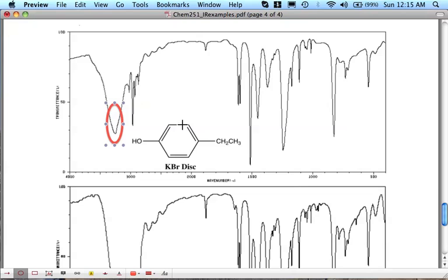It's those C=C vibrations. And remember I said there's usually multiple ones at slightly above, starting at 1600 and going down to maybe 1450 or something. So these right in here are definitely our carbon-carbon double bond ring vibrations. So again, there's one at around 1600, one slightly below this one.